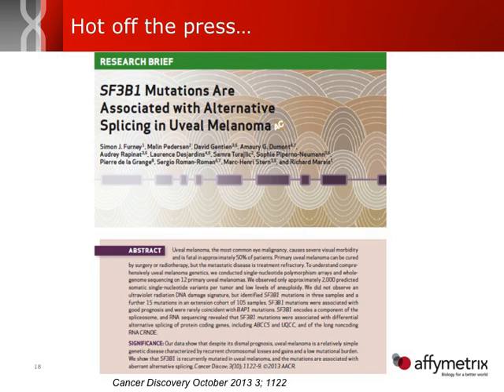And they found that alternative splicing was one of the major contributors to the prognosis associated with this particular disease. And they saw some alternative splicing events in the human transcriptome data that actually was missed in the RNA-Seq data. And we'll talk a little bit more in depth about that further down the line. But I just wanted to show you something hot off the press, just came out this month. So we're seeing that this is really important, and it's important to look at both levels of differential expression when you're doing your research.